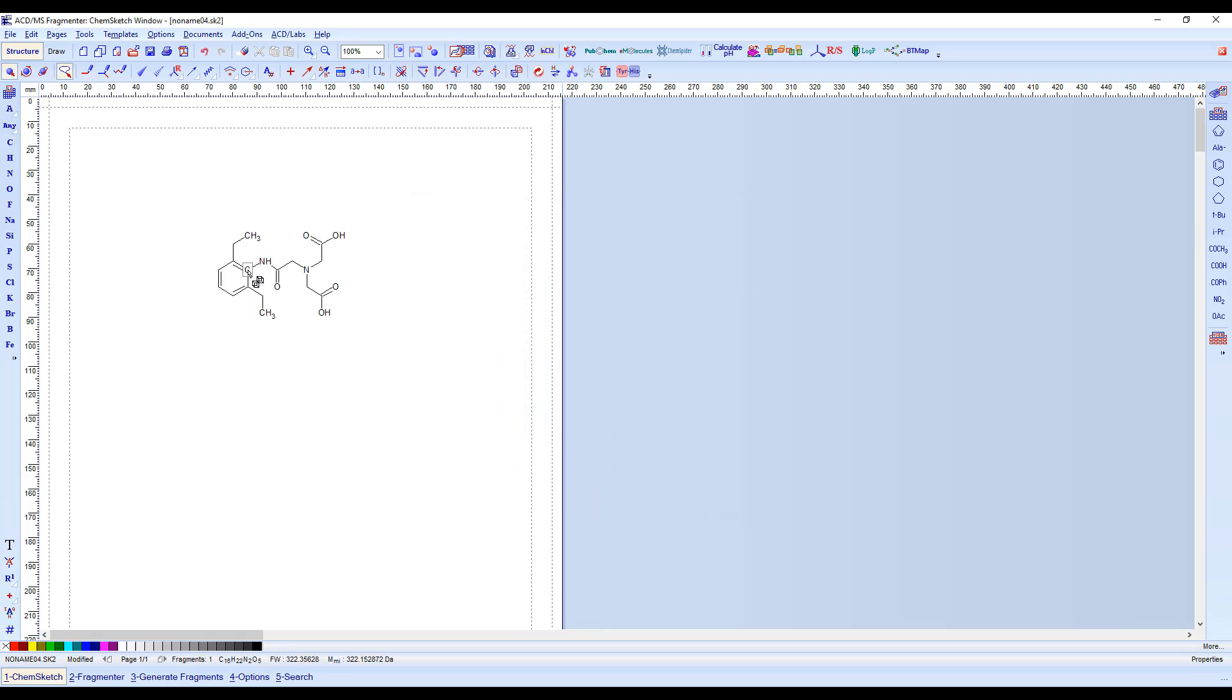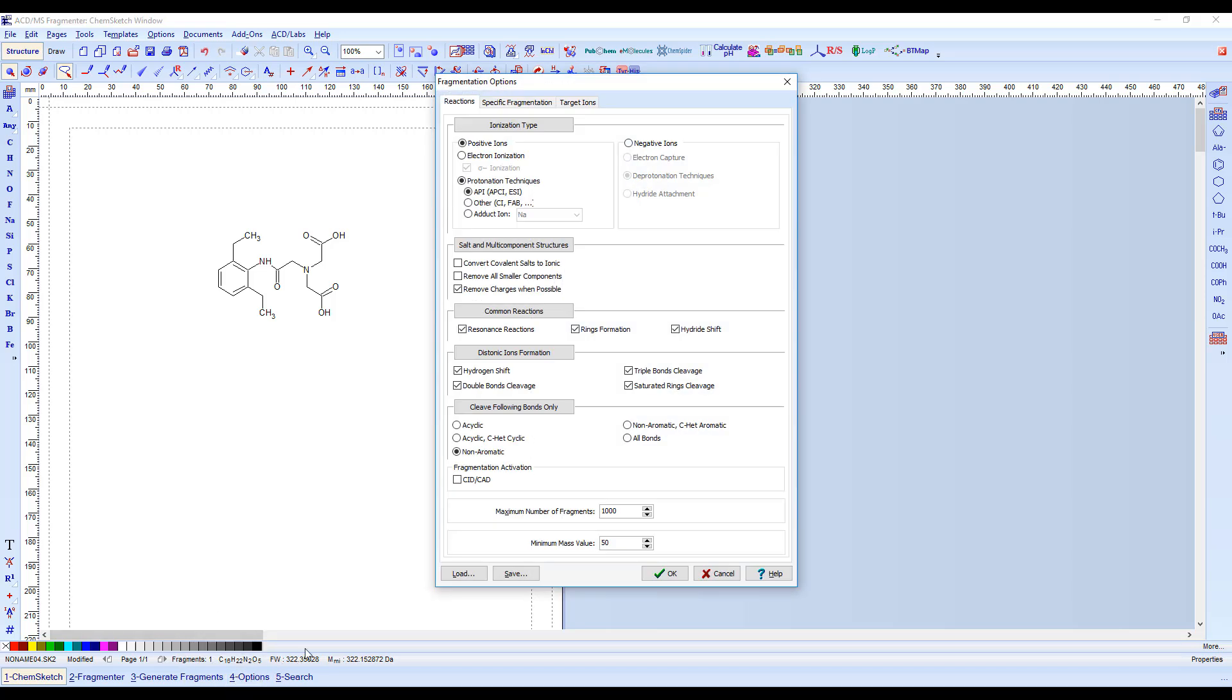Click Options in the navigation toolbar to review the MS Fragmenter options. An important thing to consider under the Reactions tab is the maximum number of fragments. The larger this number is, the longer the computational time will be.